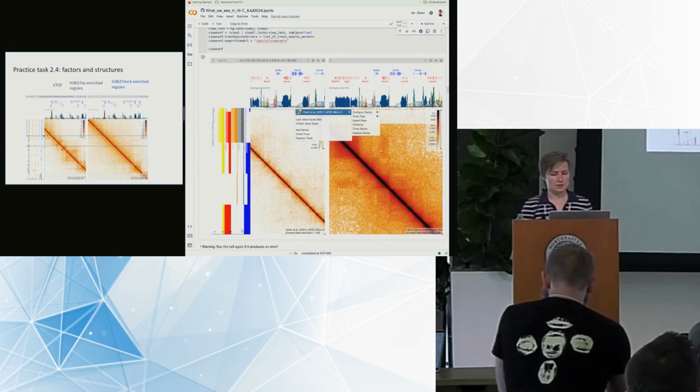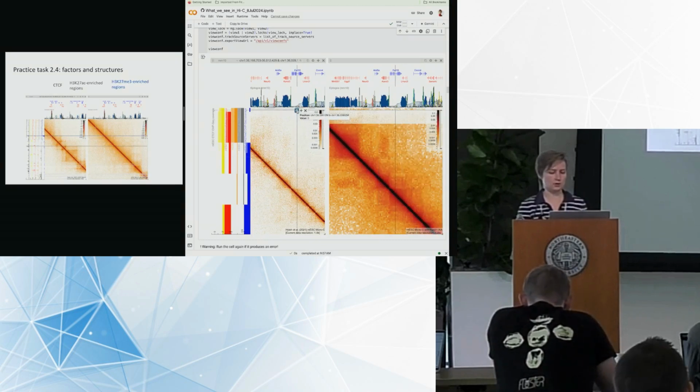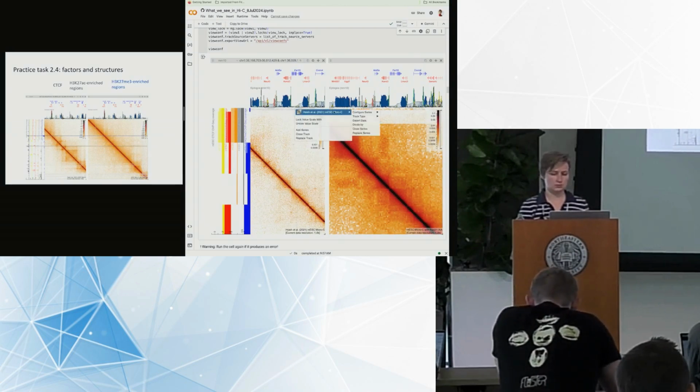We can go to the settings of this view, and we can set up the zoom limit. So again, if I hover on the top right corner of my view, I can press the gear button, select the dataset, configure series, and then I zoom in and set up the resolution.